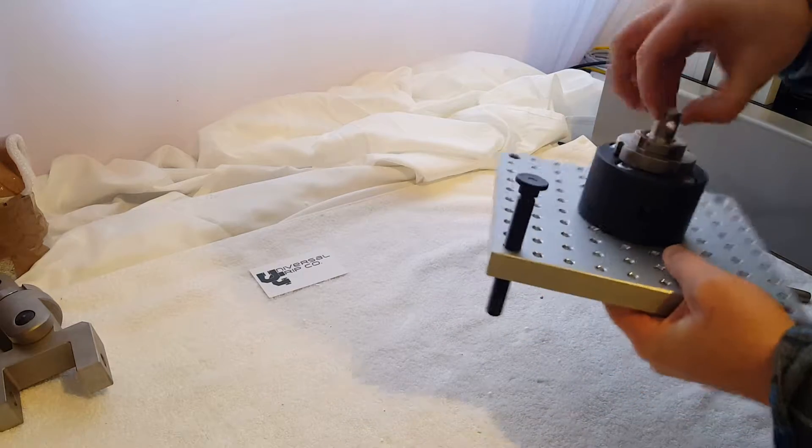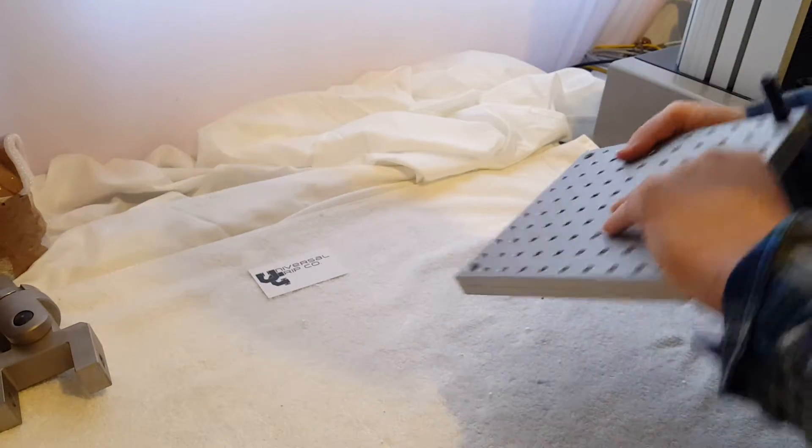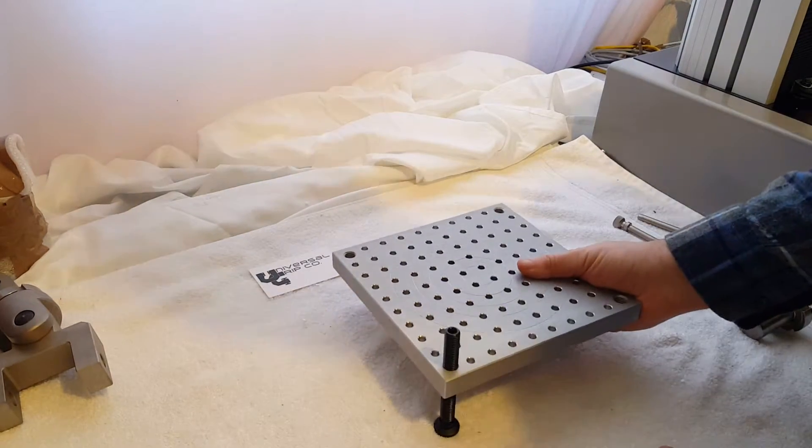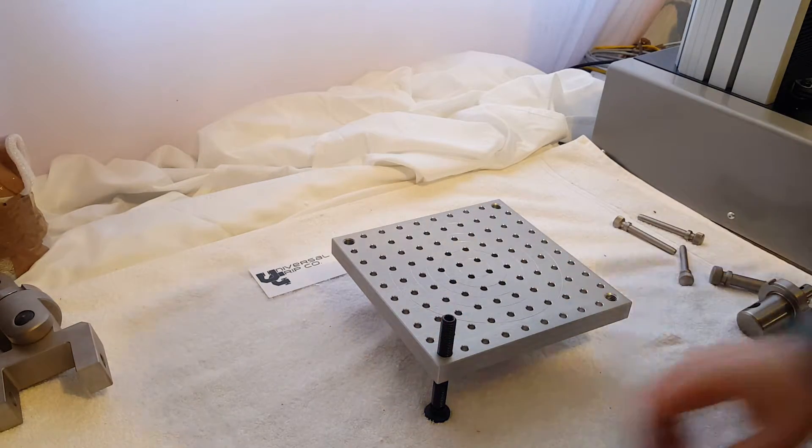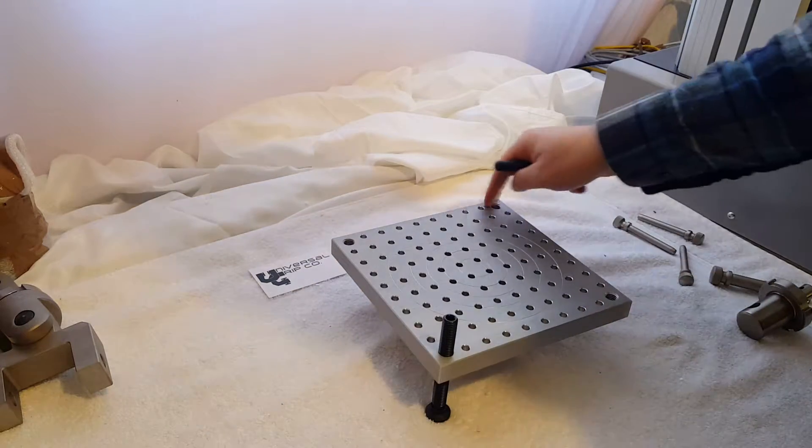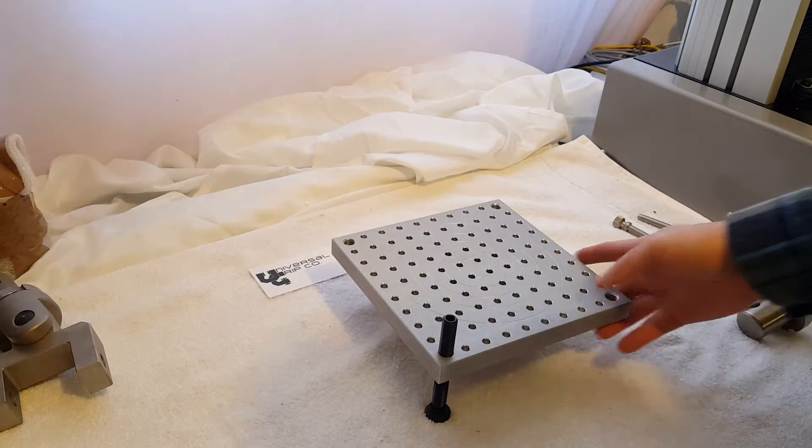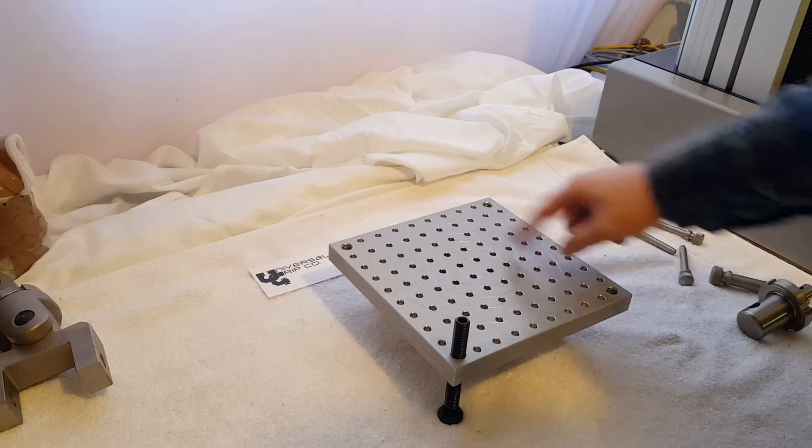What's nice about this compression plate is that it also comes with these screws to reinforce it on the table. There are four sets of screws which go on each corner. This plate is about 8 by 8 inches.